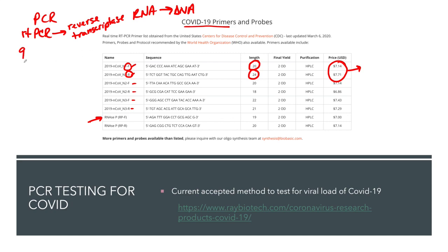There's also what's called qPCR. This is quantitative PCR, and it used to be called real-time PCR, where the nucleotides have little fluorescent tags attached to them, and inside the thermal cycler there will be a camera that actually detects fluorescence. The more fluorescence occurs, the more copies of the DNA sequences have been made.